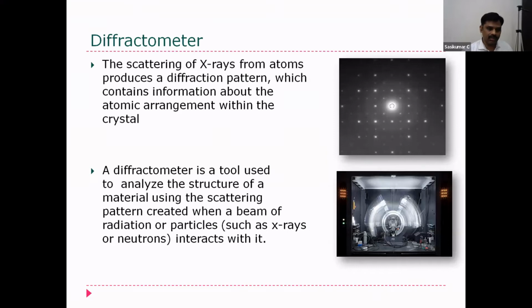Materials are made of crystals, and the crystals have regular repeated arrangements in 3 dimensions. So all these things we have studied. So what Laue thought was, if this concept is true, that the crystals have a repetitive, regular arrangement of atoms within them, then they should act as a grating. So they should be involved in the act of diffraction. They should diffract a wave actually. This is the first idea he had.